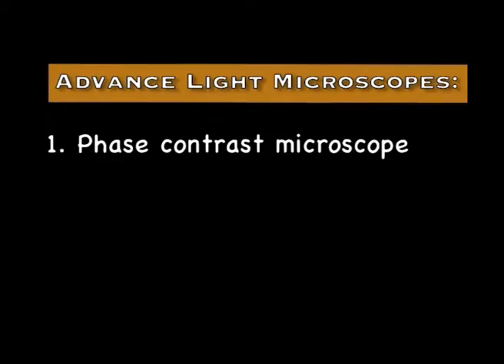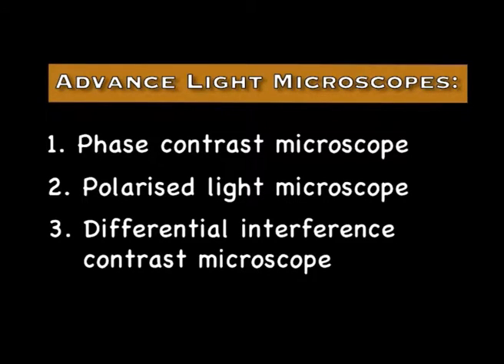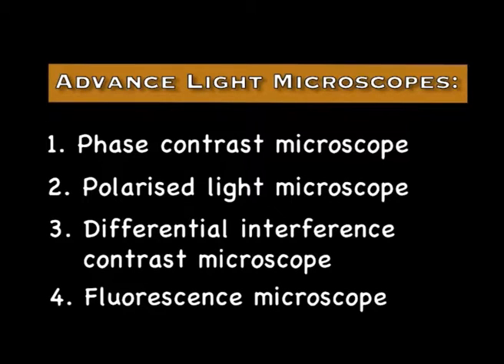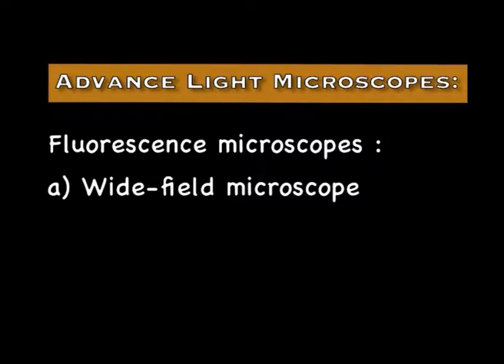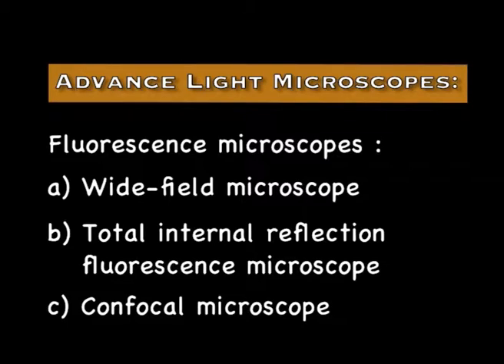Welcome viewers. Today I am going to discuss advanced microscopic techniques, and we will talk about phase contrast microscope, polarized light microscope, differential interference contrast or Nomarski microscope, and fluorescence microscope. And fluorescence microscope can be categorized into wide field microscope, total internal reflection fluorescence microscope, and confocal microscope.